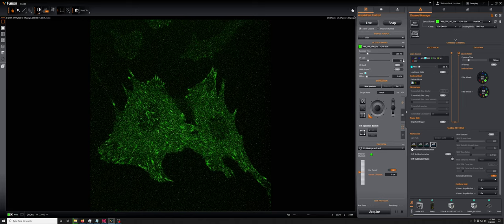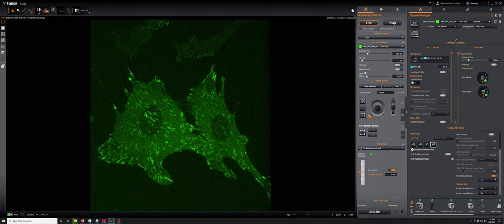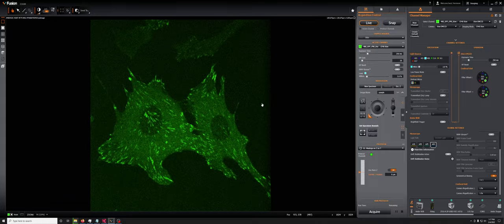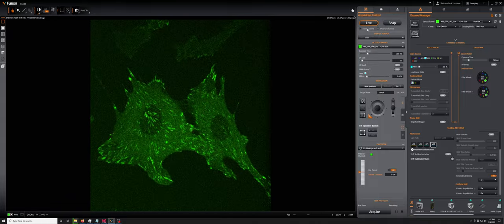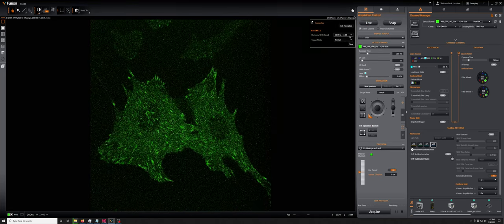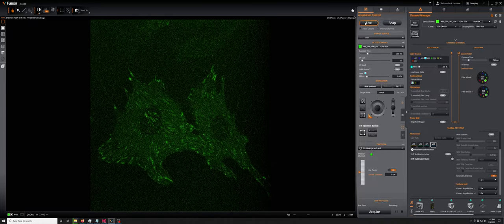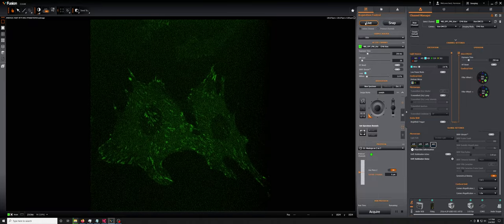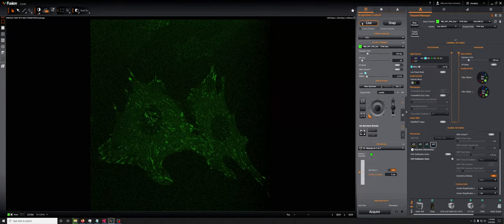Where this becomes most noticeable though is when you're in a situation where maybe you didn't have enough EM gain. So this is the version at 10 megahertz with an EM gain of 20. And look at the version with 30 megahertz. So it's noticeably more noisy.